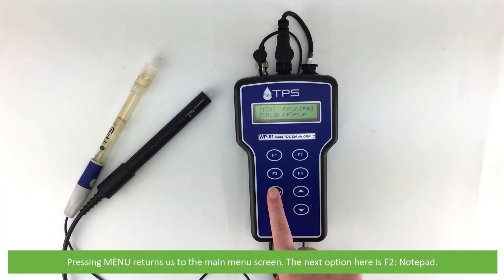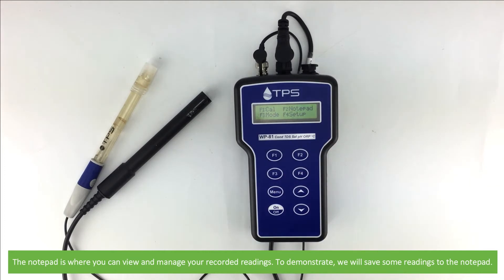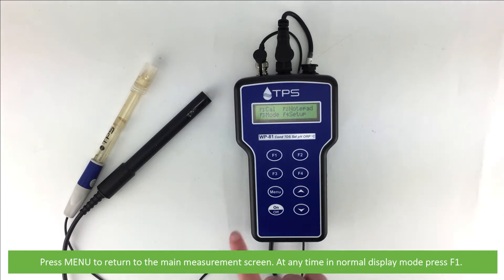The next option here is F2 notepad. The notepad is where you can view and manage your recorded readings. To demonstrate, we will save some readings to the notepad. Press menu to return to the main measurement screen. At any time in this normal display mode, press F1.